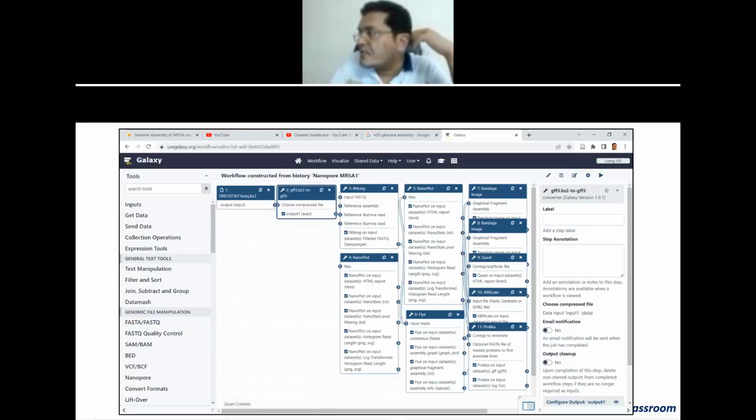So let's say you have another set of data coming from another site. You can just feed the data on the top. You already have your pipeline ready, what tools to use, what is the type of input that is to be given. And you know that here, the output of one process is the input for the next process. So the files are created accordingly. So exactly the same process will be followed, and very smoothly your process will be done until the end. So this is the advantage that you have with Galaxy.